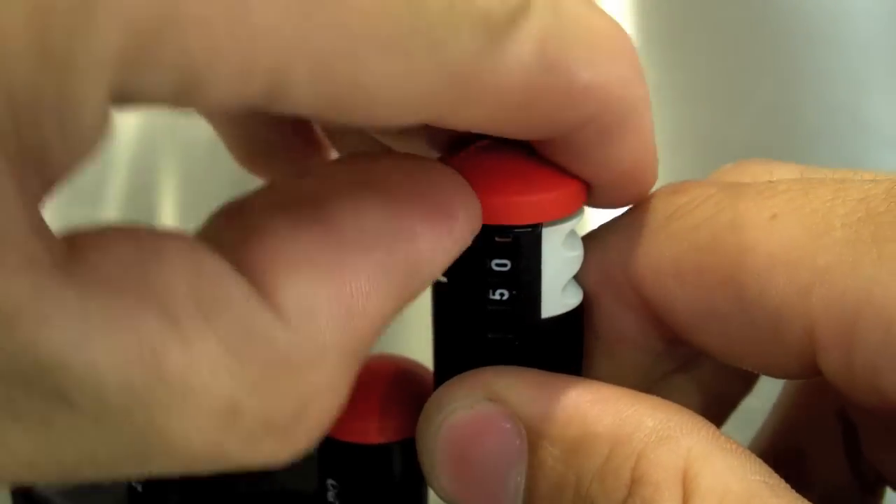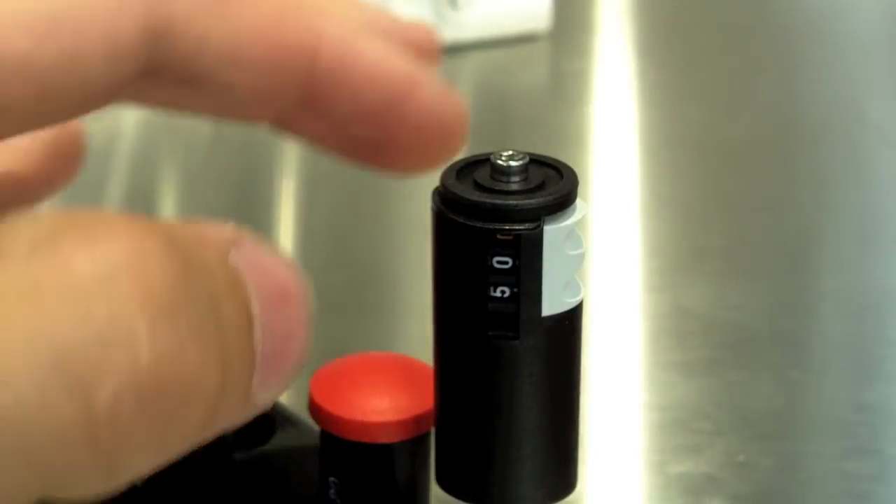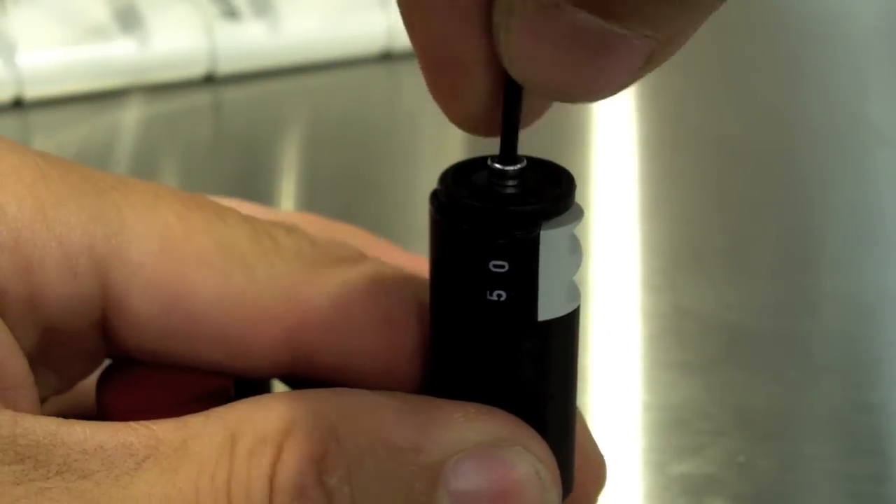Take off the cover and unlock the micrometer.